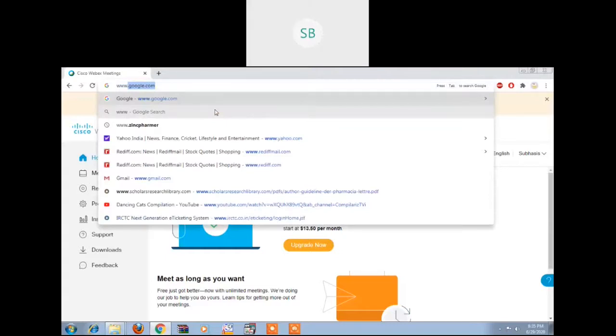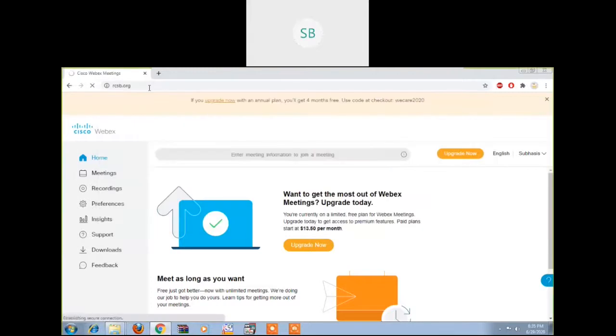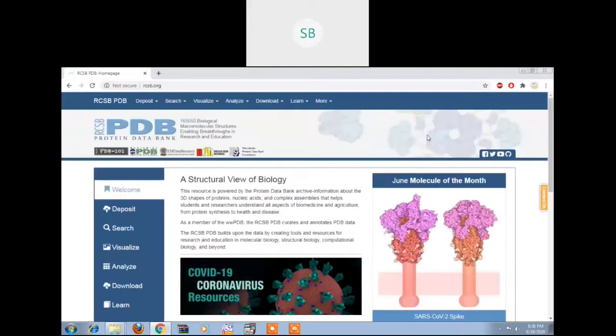One of the most used sites is www.rcsb.org, that is the Research Collaboratory for Structural Bioinformatics, right? You can also get it from NCBI, that is the National Center for Biotechnology Information. But as we are dealing with this, let me take you to that. I have typed here RCSB. Let us wait some more time so that the page will open. Yes, the page has opened now.